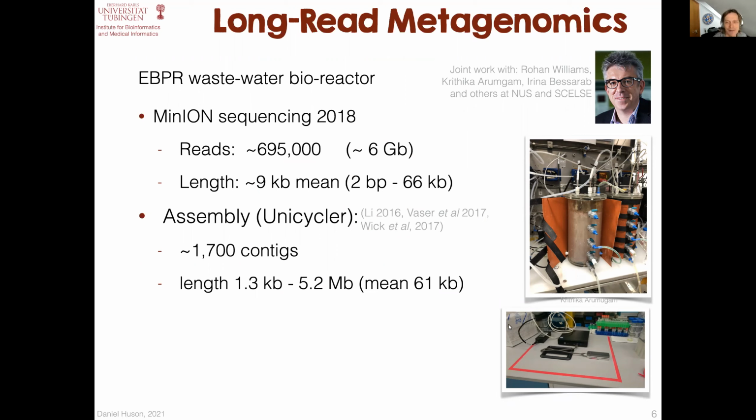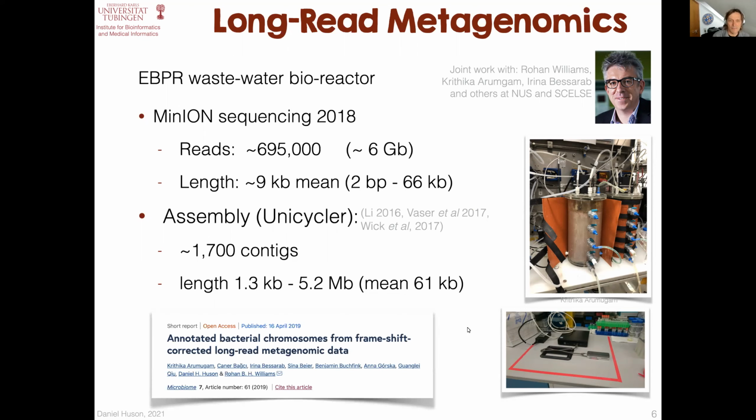She's the one who actually runs the sequencer that you can see down on the bottom right there. That's her sequencing station. So she got 6 gig out of a sample taken from an enrichment bioreactor, with 9 kilobase read length. Then, using the Unicycler pipeline back in those days, we got a very nice assembly that we then published.